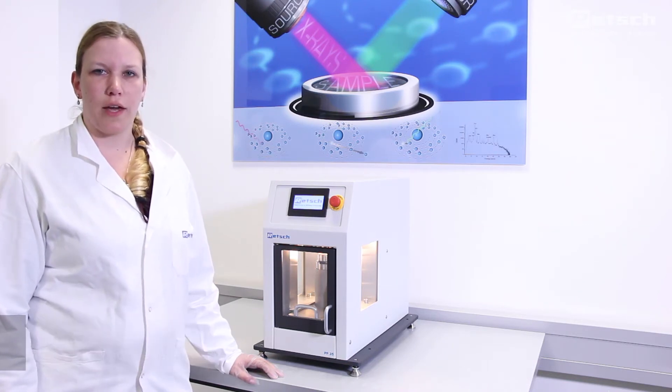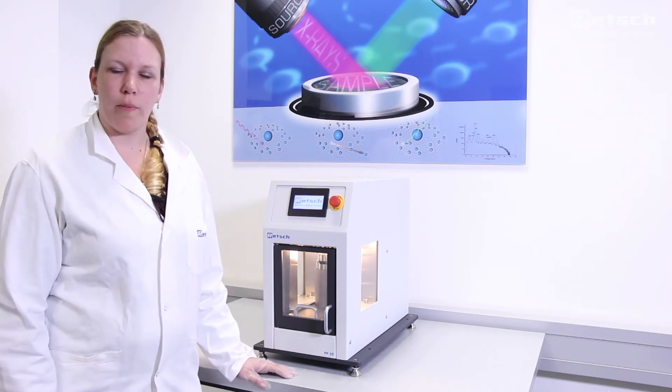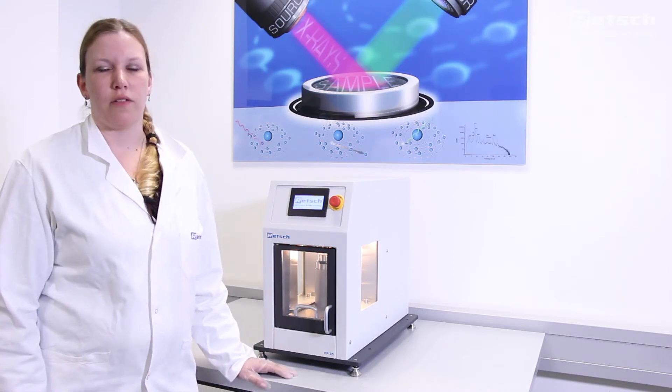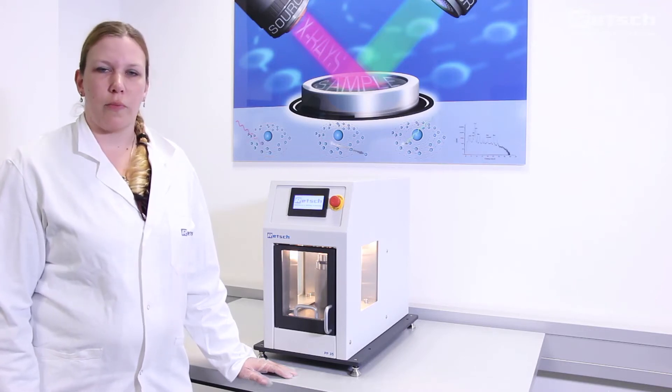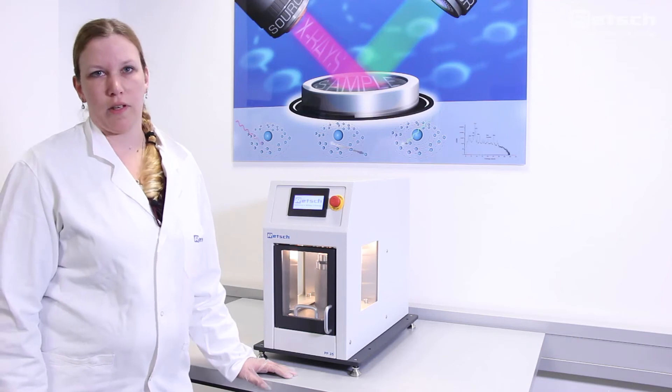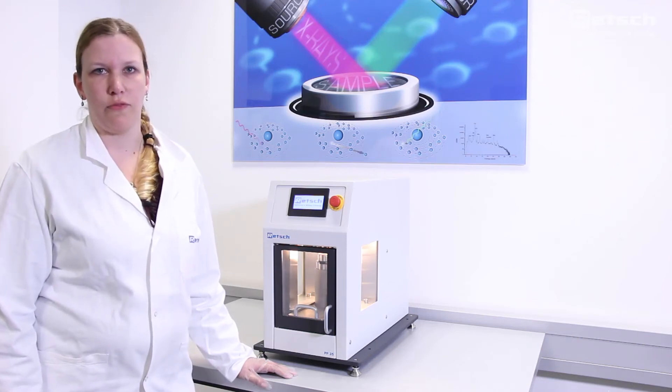In this video I'd like to show you the handling of our new Palapress PP35. It is a small benchtop model and applies very high pressure forces up to 35 tons. It is used for the preparation of stable sample pallets with a smooth surface for perfect XRF analytics.